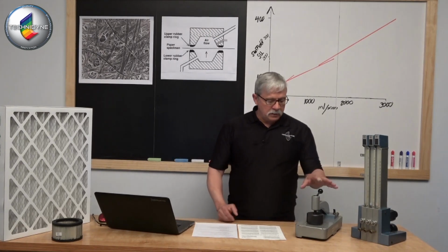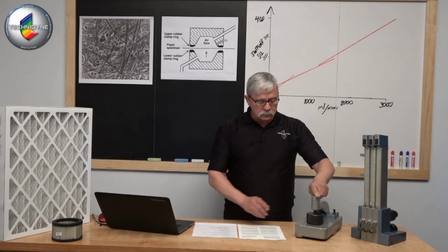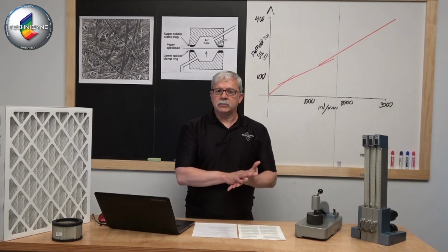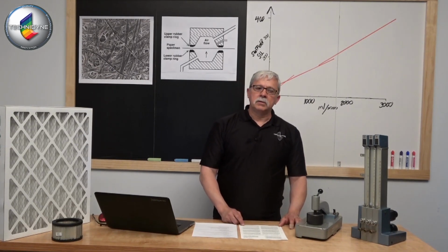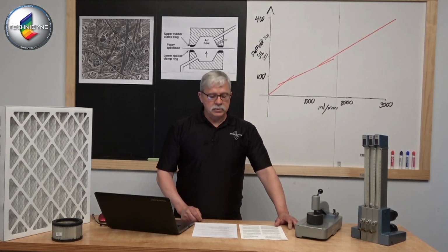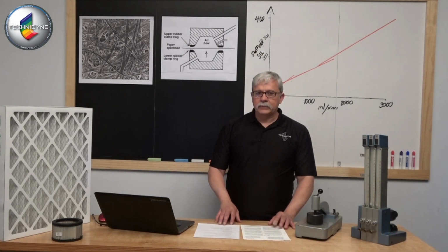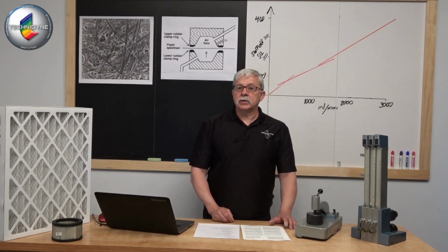They used a clamping mechanism similar to what I have here on the table, with the exception that they had a rubber diaphragm on the top side and the bottom side, and that diaphragm was put together in such a way that it defined the area that we were going to test. One of the more common test areas used in North America and Canada was the 3/4 inch orifice diameter. That was big, I think, in the production of newsprint.